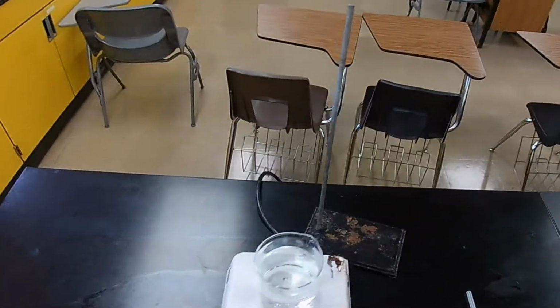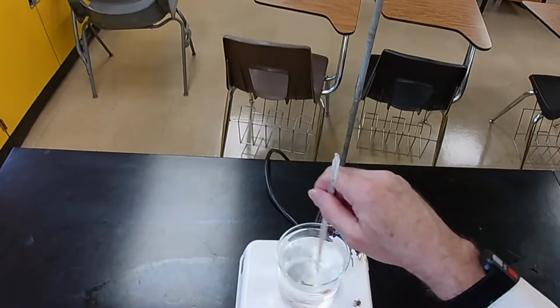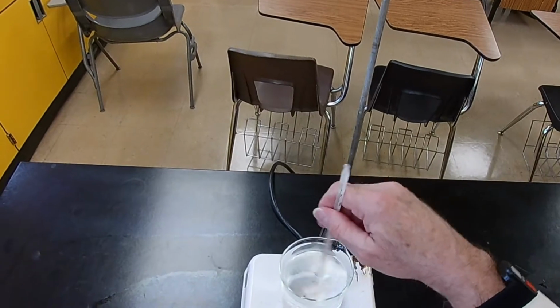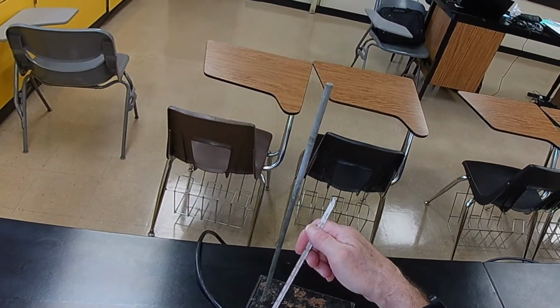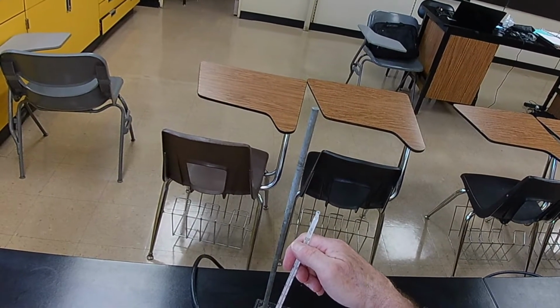So, first thing we need to do, we need to get hot water. Let's see if this water is hot enough. It needs to be at least 70 degrees. And this is distilled water. And it looks like it's made it to 70. Okay. That's good.